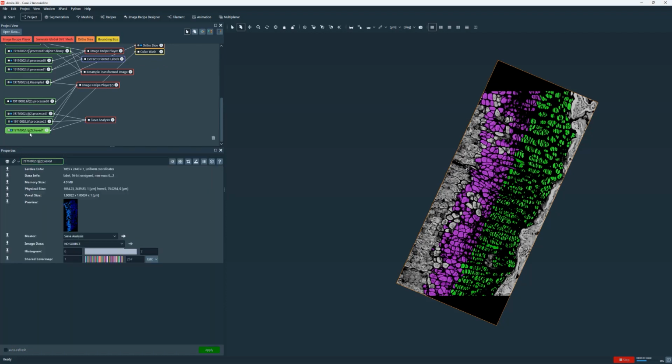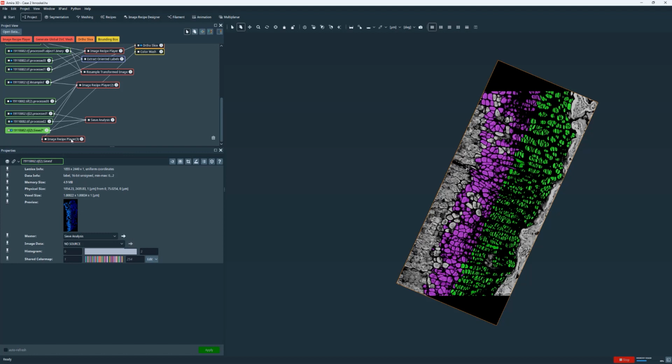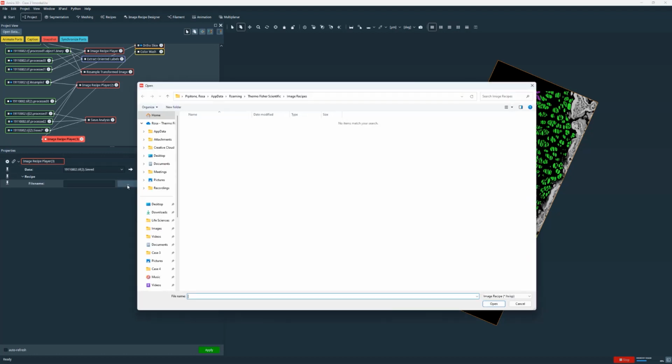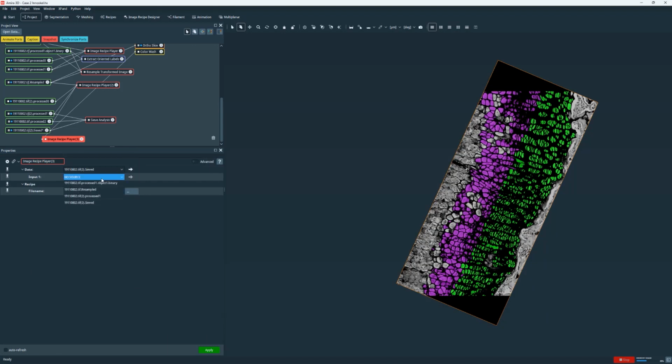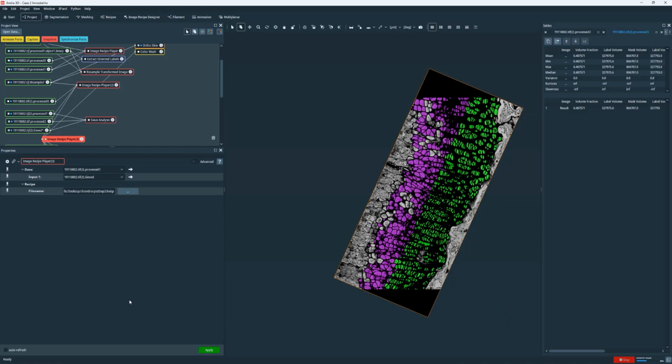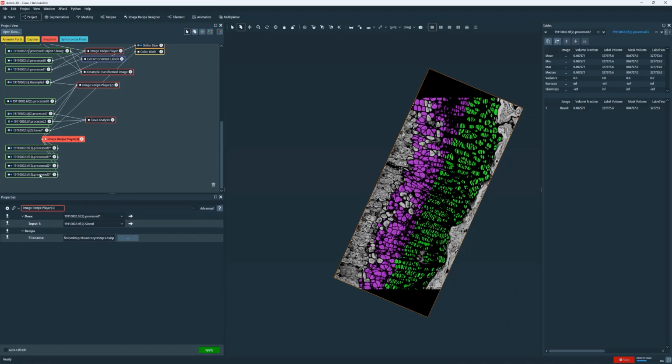So now if we want to proceed with the quantification of the two cell populations, we are going to use a third recipe. This time the recipe is the chondrocyte step 3, which is here. The input data is the sieved results, which correspond to the last results obtained from the second recipe. And here we can observe 4 different results.